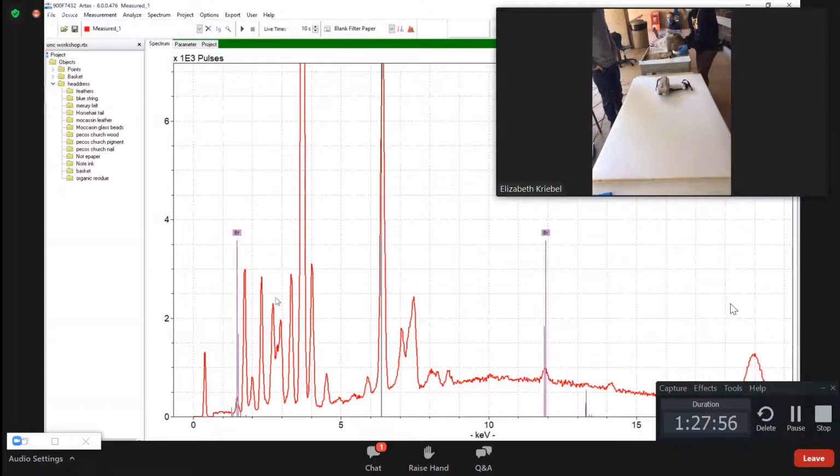We've got a comment that's probably pine pitch. Yeah, that sounds right, frankly. It looks like a kind of reddish brown, amber colored granules on the inside where it's been shedding. I don't drink alcohol, but one of the things I've always wanted to try is this: in ancient Greece they used pine pitch to seal wine casks, so the pine resin really infused the wine. I've always wondered what that tasted like. Maybe someday. For the rest of us, it tastes like Retsina.